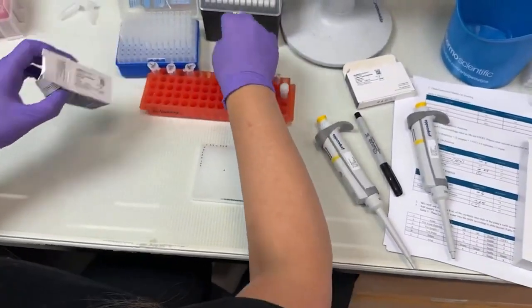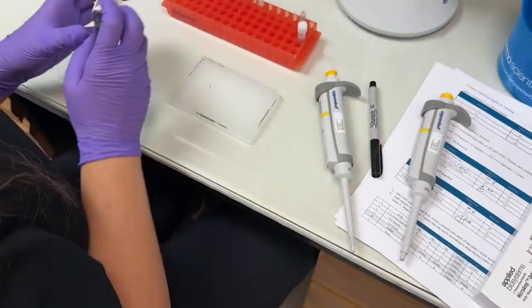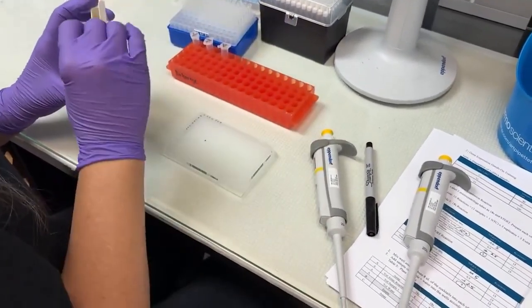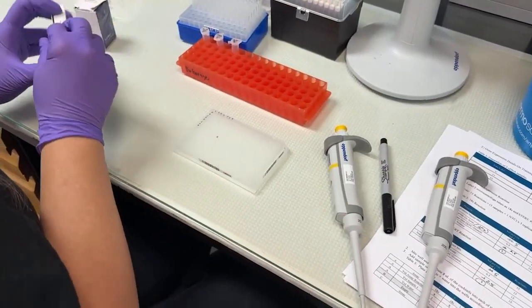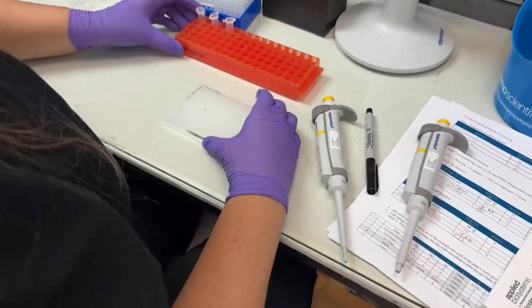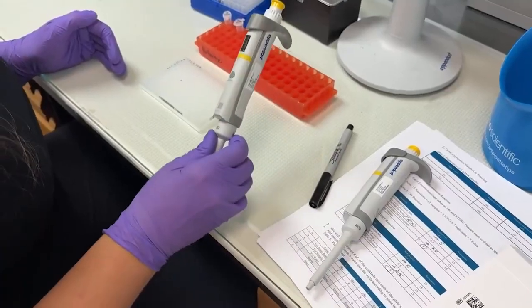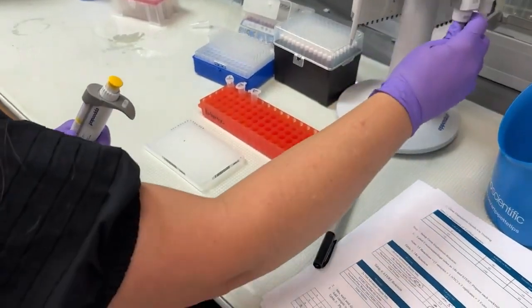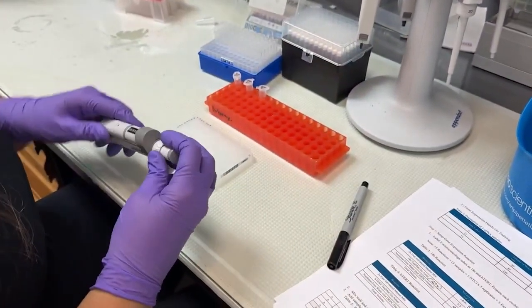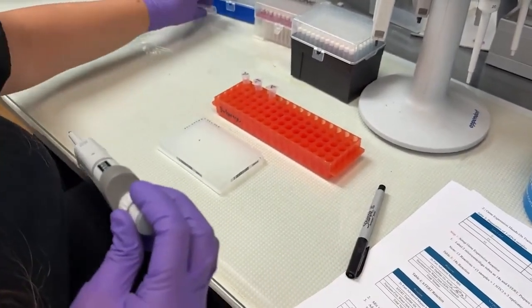Before I move on, I'm going to take care of my items and put them back on ice so that they remain useful for the next experiment. Now what's left? Putting sample into that reaction mixture. The way this was set up is I had 8 microliters of my master mix, and now I'm going to add 2 microliters of my sample to each one of the reactions.